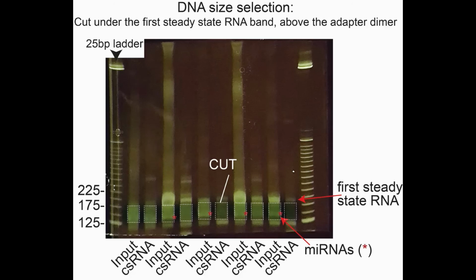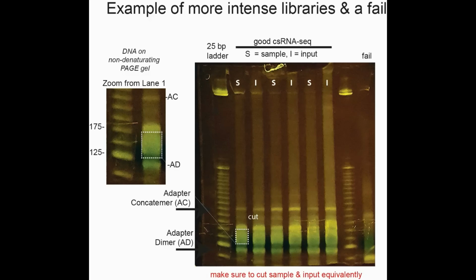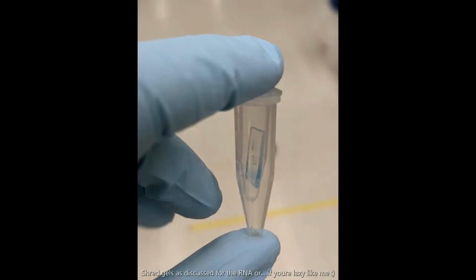In general, it's also good practice to avoid the outer lanes. Run the gels for as long as possible, which may require some optimization. With my gel setup, I run the gels for 15 minutes at 80 volts, followed by 73 minutes at 180. If you're in a rush, while the gel is running, prepare gel shredders. This would allow you to continue to the DNA cleanup within an hour.